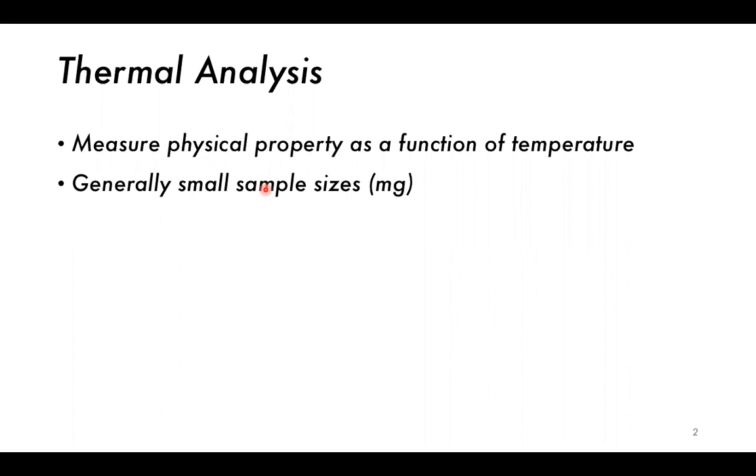So it can be done. And if you wanted to do that study, you could try to see the long-term stability of your product, because maybe it starts off amorphous and then becomes crystalline. And usually if something does that, it typically becomes more brittle as it becomes more crystalline, because the crystals have a kind of seam along which you can break it.